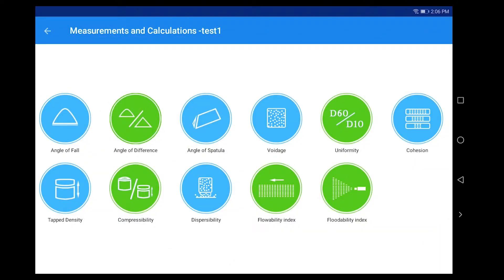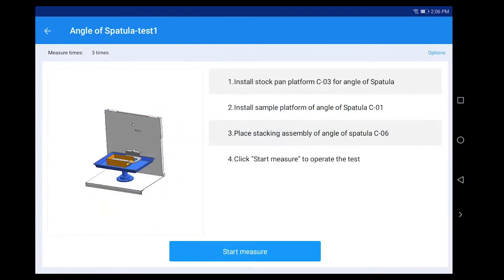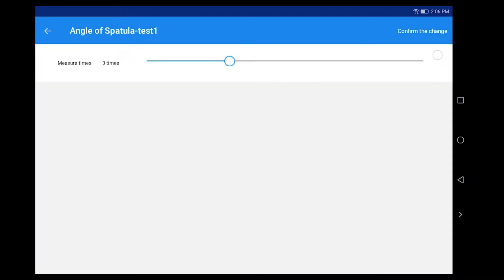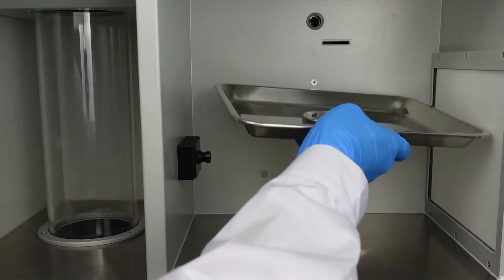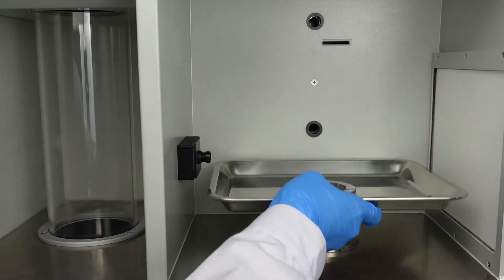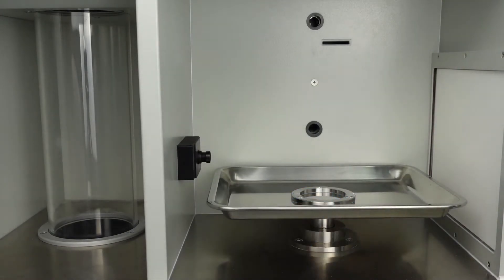For angle of spatula measurement, click 'Angle of Spatula', then click 'Options'. Set the measure times as required — normally it repeats 3 times. Install stock pan platform C03 for angle of spatula.